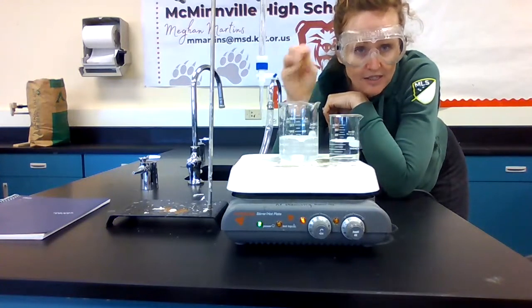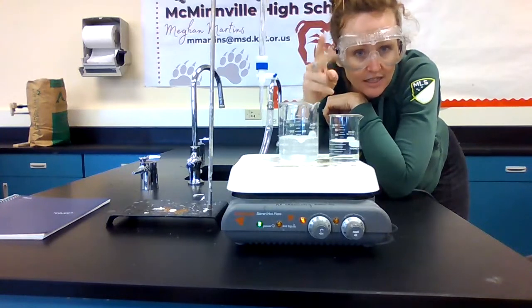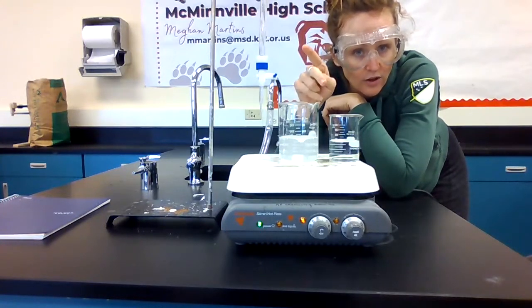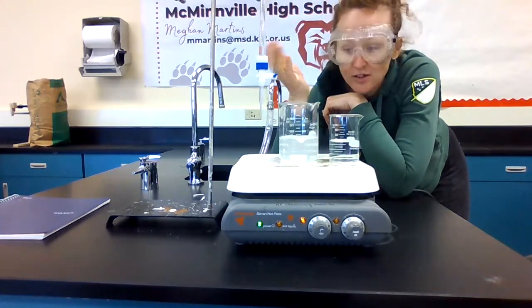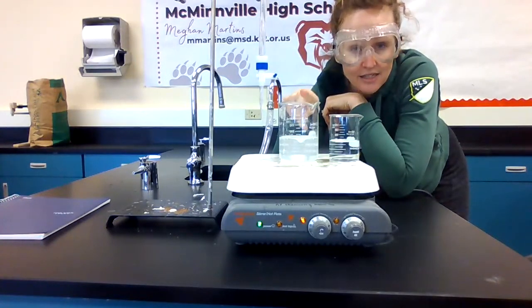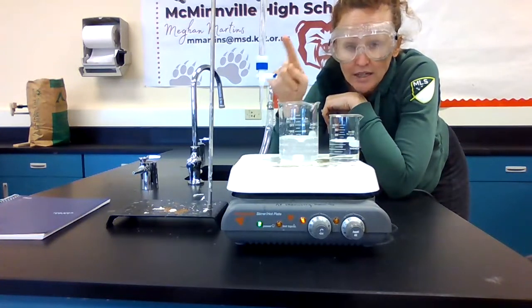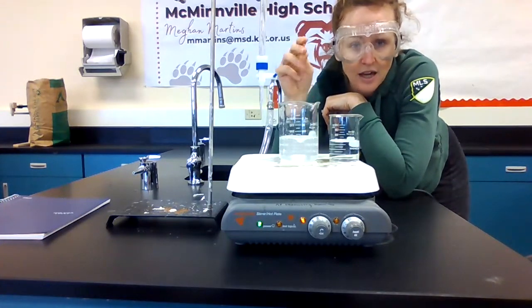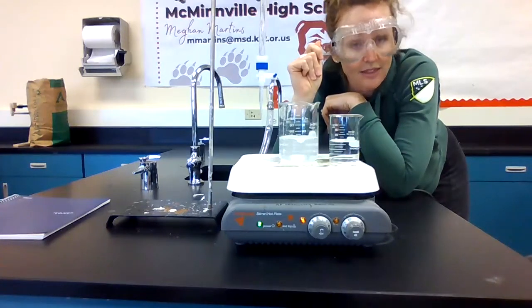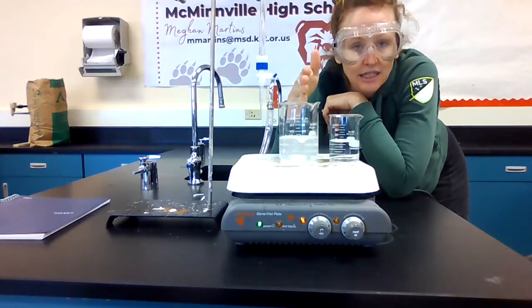That extra base just floats around and flips our phenolphthalein into the basic form, which is pink. So when we still have acid in here, it's going to be clear, clear, clear. As soon as we get that one extra drop of base, our solution's going to turn pink. And that's when we know we have reacted all the acid in our beaker.